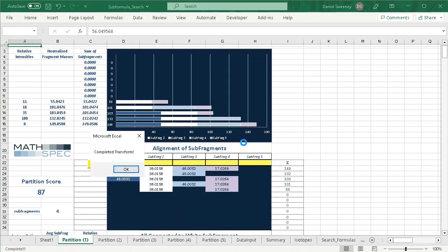The main advantage of this new approach is that the limit of 145 characters for the hyperlink to PubChem no longer is a limitation.